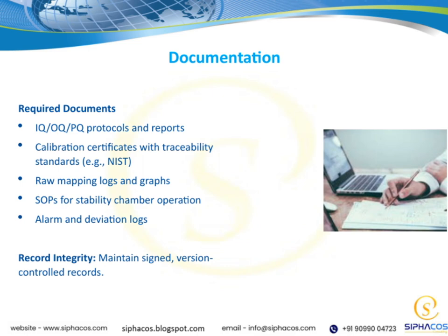Lastly, alarm and deviation logs are vital. They record any deviations or alarms that occur during operations, allowing us to track issues and ensure proper corrective actions are taken. Throughout all of this, record integrity is fundamental.